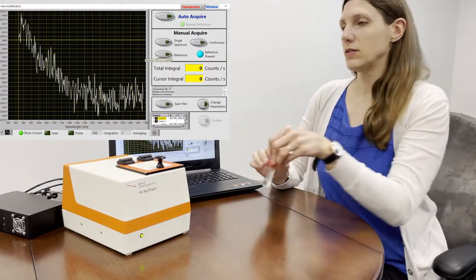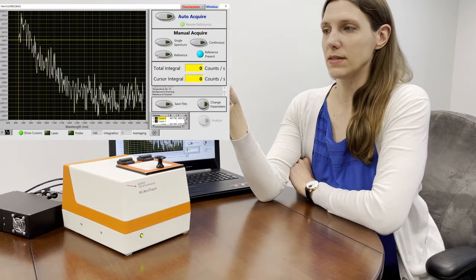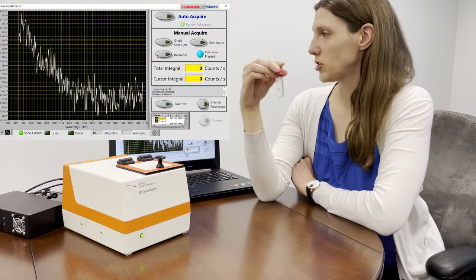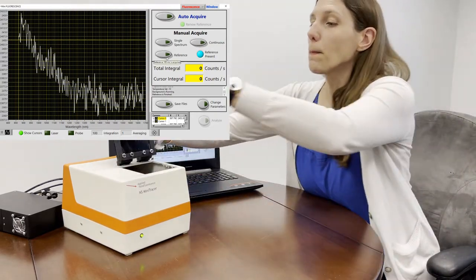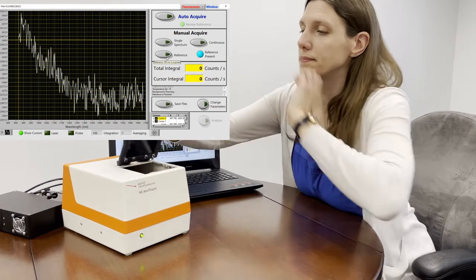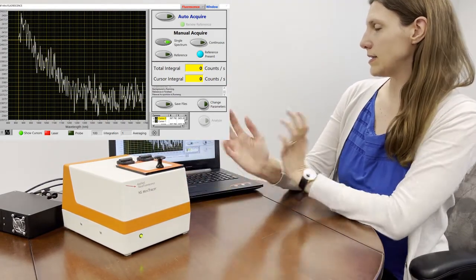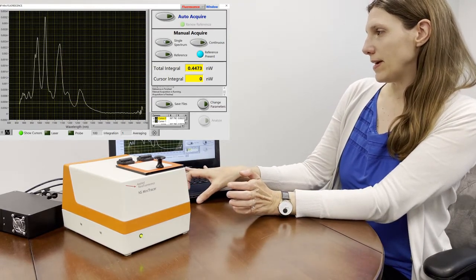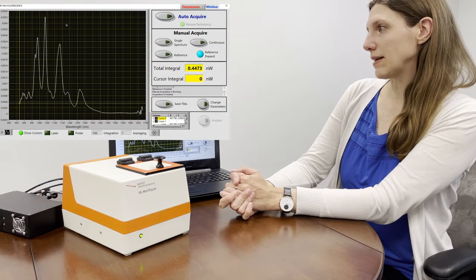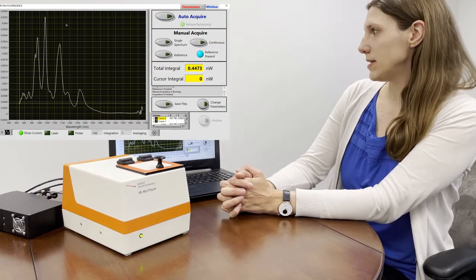near-infrared spectra. So I have here a sample of single-wall carbon nanotubes. It's incredibly dilute, looks just like water. Put it into the sample holder and take a spectrum. And just like that, we have a very nice single-wall carbon nanotube spectrum in 100 milliseconds with a single acquisition.